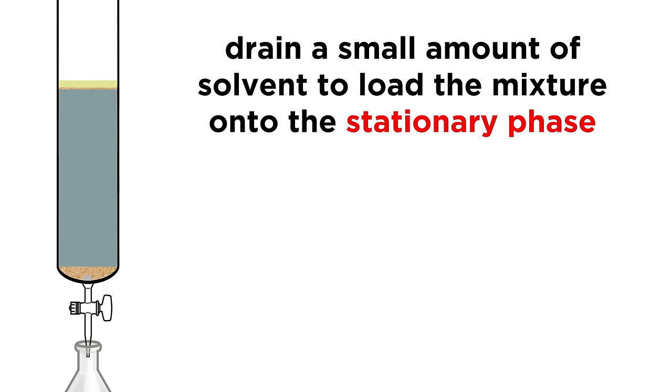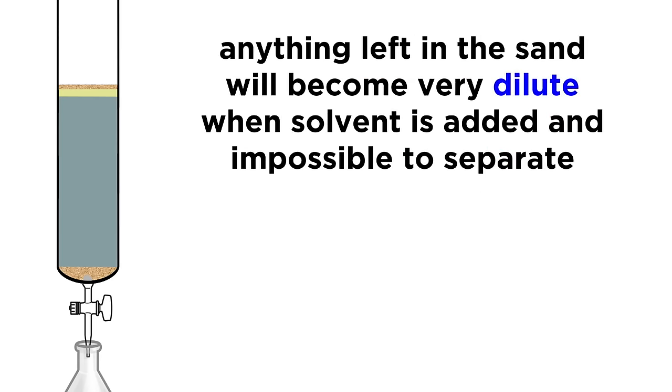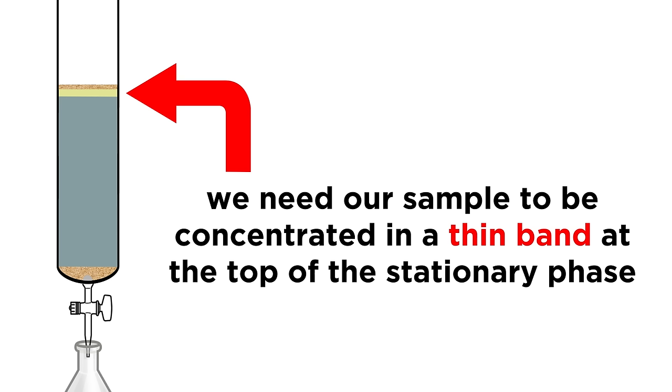We can then drain just a little bit of solvent, so that the mixture will move through the sand and just enter the stationary phase, so it sits just below the sand, in a nice even band. Make sure the solvent level lowers just enough that none of the mixture is left behind in the sand, or this part will not separate properly, as anything that is not loaded onto the stationary phase will become very dilute once solvent is added, and therefore impossible to separate. We need our sample to be very concentrated in a thin band at the top of the stationary phase for separation to work.